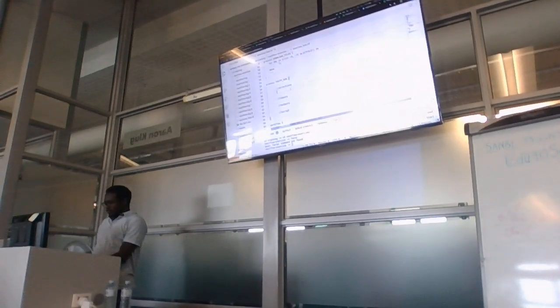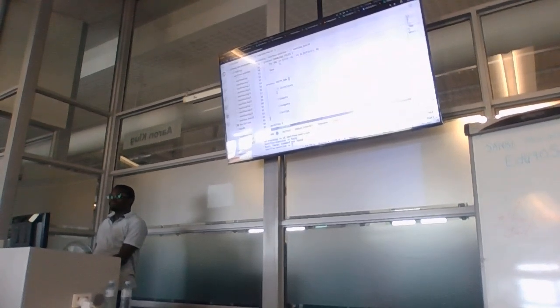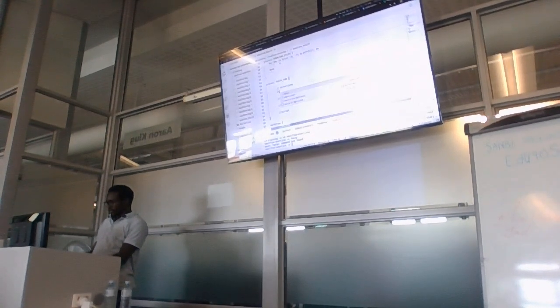So we learned about how we can install these tools on our machines, right? One option was to use Conda. And then which channel is it in the Conda? It's in the bioconda, right?